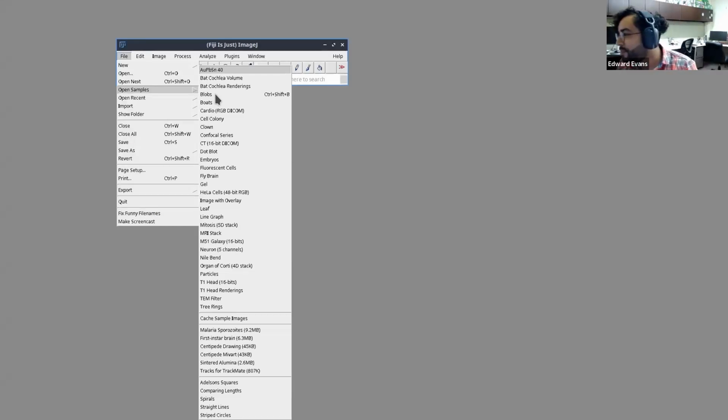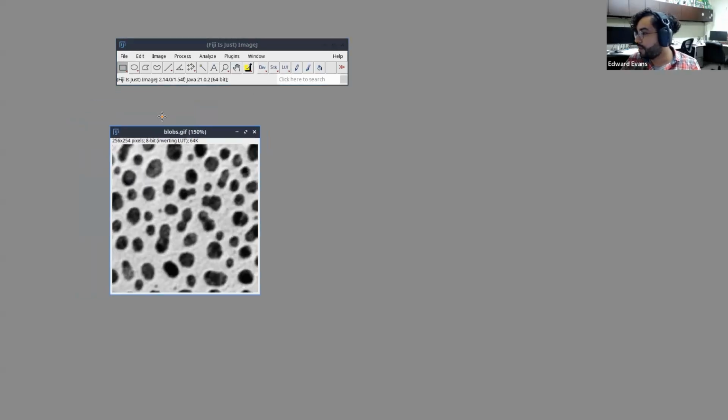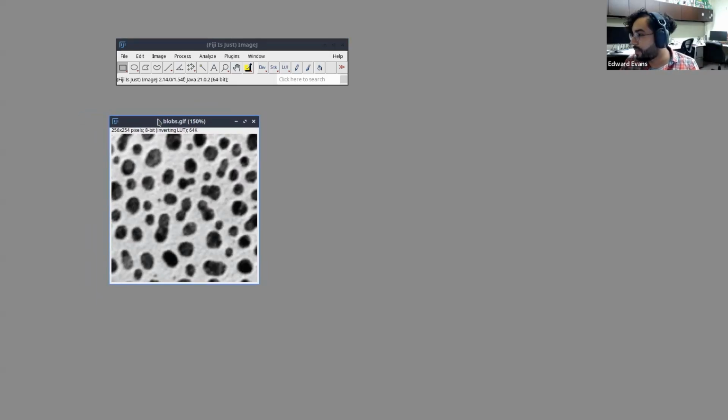I like those a lot, but I know you can't see what I'm doing, and windows will start popping up. So if something happens like that, just let me know, and I'll try to go back and tell you where it is in the menu. So if you open up blobs, here we go. And I'm going to make this a little bigger. All right. So now imagine this is your nuclei or something.